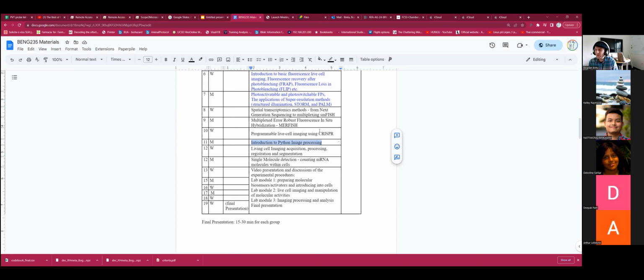I can say from my experience, two years back I was a graduate student, and one of the things I appreciated from a machine learning course that I took was some of this core infrastructure, like how to open Python Jupyter notebooks in a particular context. Things you'll learn, for example, include Napari, which is the equivalent of ImageJ for Python, and it's hardware accelerated, so you can open an image in a more modern way and actually process it. Kinds of things like those are going to be underlying the course from here onwards, and could be generically useful for anything to do with imaging, even basic programming. Having a little bit of infrastructure here should be very generically applicable.